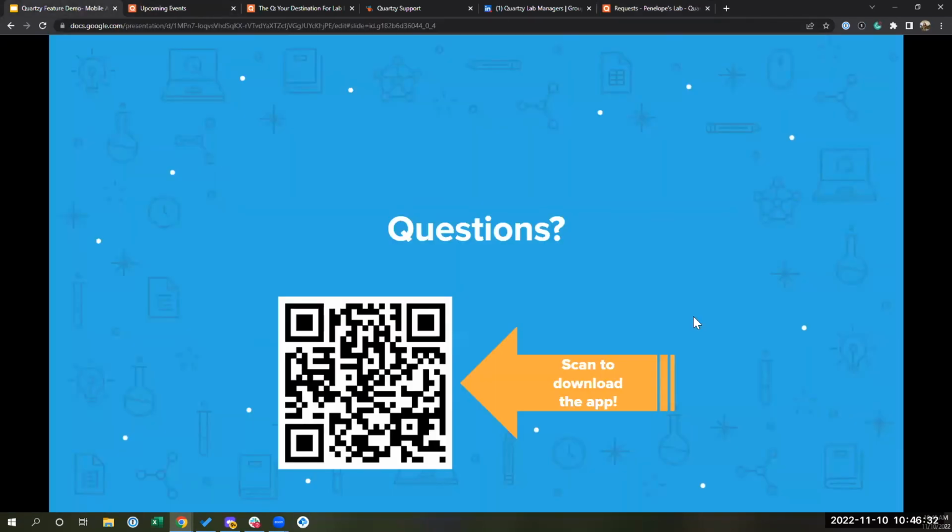Excellent. And we have another question. If I don't have my phone, are packing slips able to be scanned with a scanner? Chris, I will let you weigh in on that one as well. Sure. So, yeah, I guess if you had a packing slip and a scanner, it would work as any other PDF attachment. I think you would just scan it and then from your computer access your printer, or I guess if you have a USB drive or something like that. The tricky part is just getting the data from your scanner to your computer at that point.